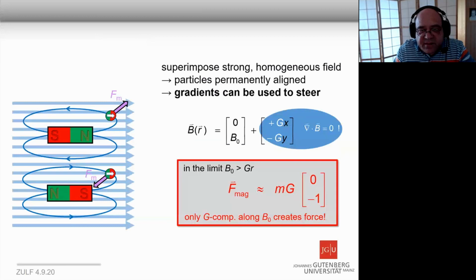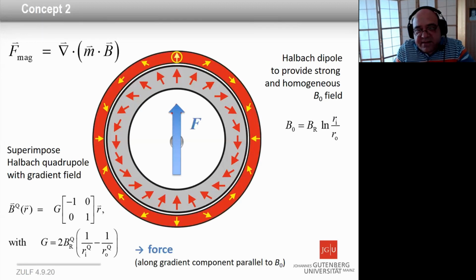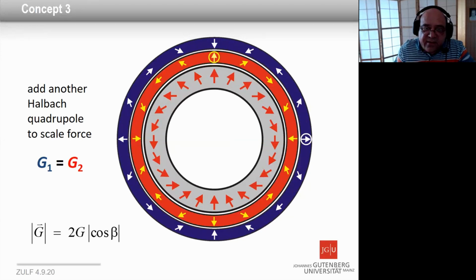And we had the idea, which is very similar to MRI, that we superimpose this whole situation with a very strong magnetic field, which is homogeneous, so that this particle or smaller thing here is always oriented along the stronger guiding field here, or directional field to orient it. And then, of course, you can shift it away or pull it towards you, depending on the gradient you use then for steering. And you can, of course, create such a system then with Halbach rings. So if you just have one ring of a dipole to create this orientation field and another quadrupole to create a force, you can rotate the force inside this ring. And if you use a second quadrupole, you can even scale the force. And with that, you can then really write with these particles.